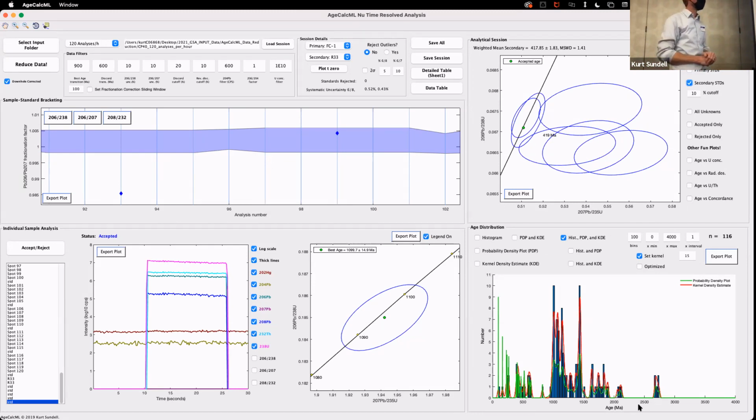This is probably the IP. 100%, yeah. This is when we find out that things are not working the way they should be. And if these aren't right, then what are you even doing, right? How can you trust the unknowns that you're trying to interpret geologically?